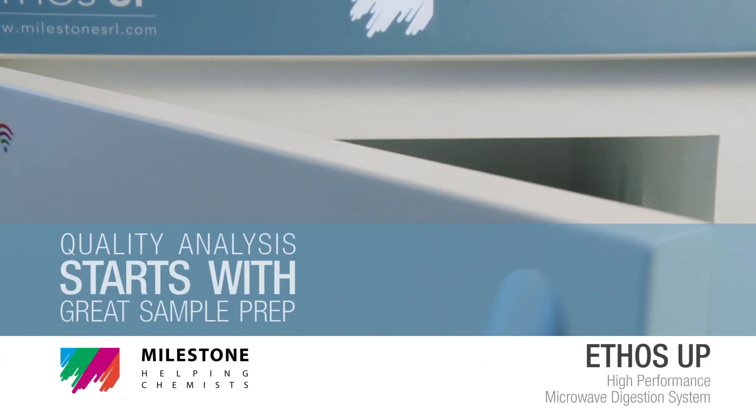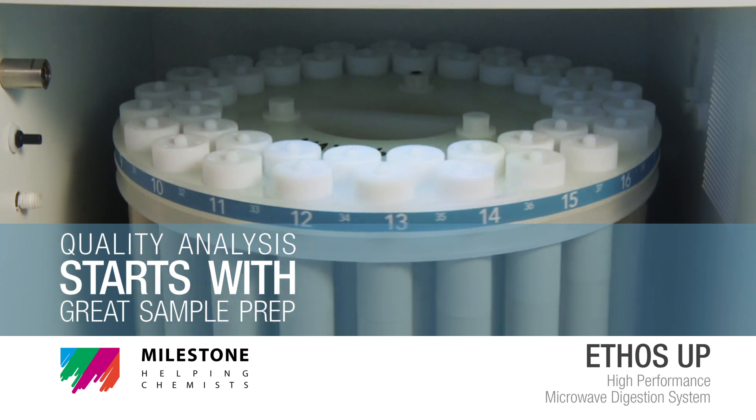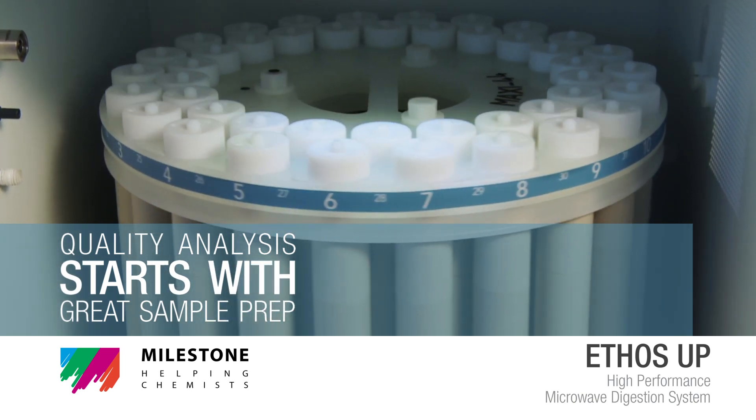Milestone Ethos Up — quality analysis starts with great sample preparation.